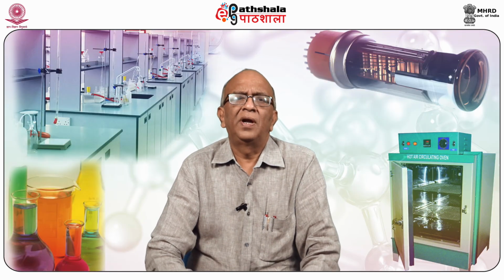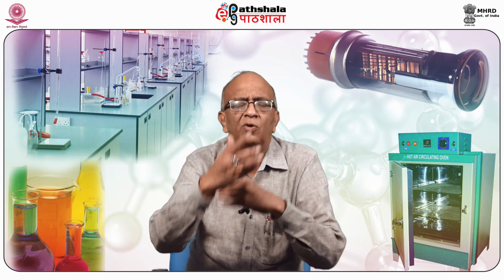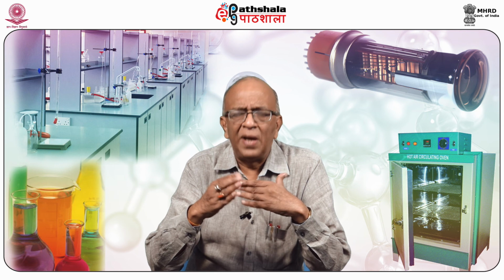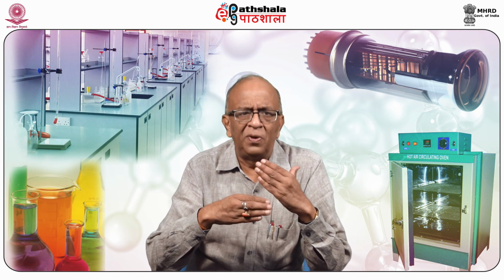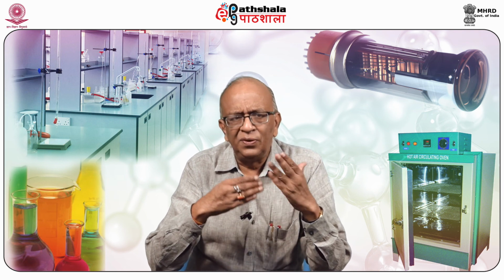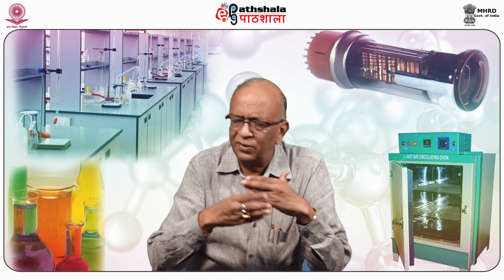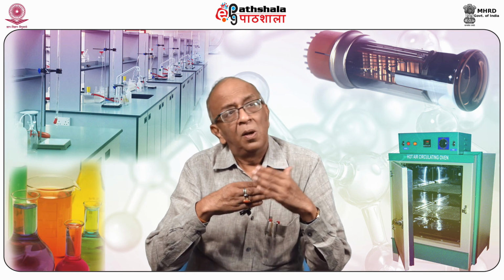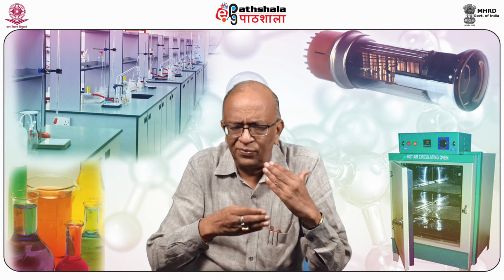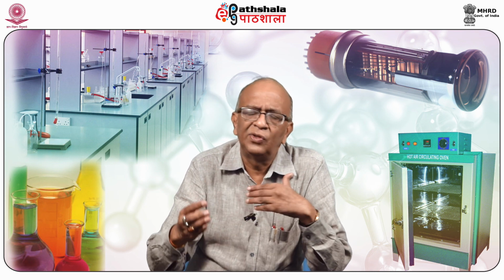In this module, students, we have learned how by paper chromatography and thin layer chromatography we can separate the constituents of a mixture by involving the principle of partition. And the principle of partition is the same as you have studied in the case of fractional distillation. It is almost the same. The important thing is that a mixture of colored substances you can easily separate and easily visualize in paper as well as in thin layer chromatography.